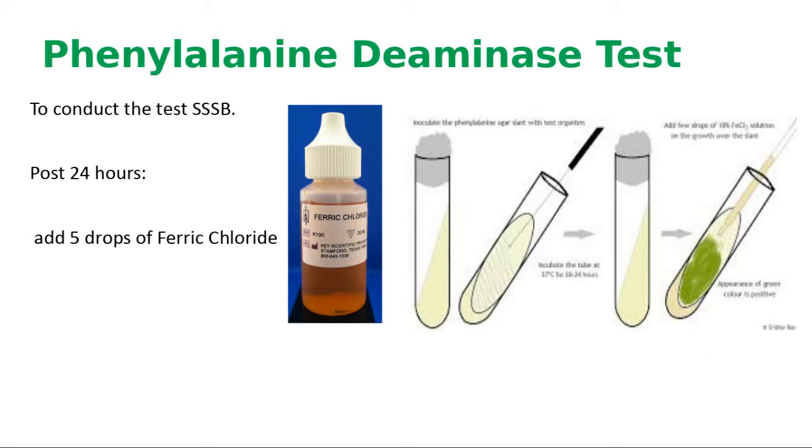You use the inoculating needle. Yeah, but what's the process called? Streak the slant, stab the butt. Thank you very much. That's correct. Streak the slant, stab the butt.